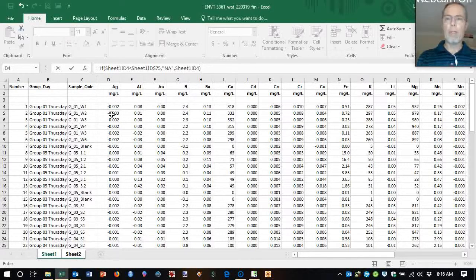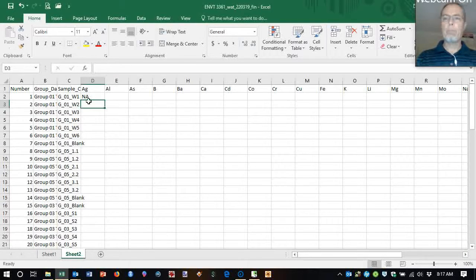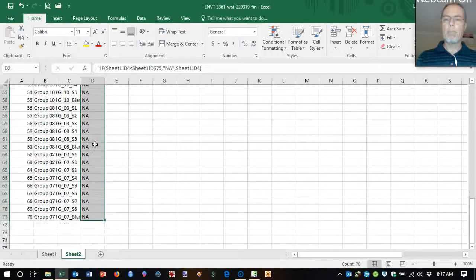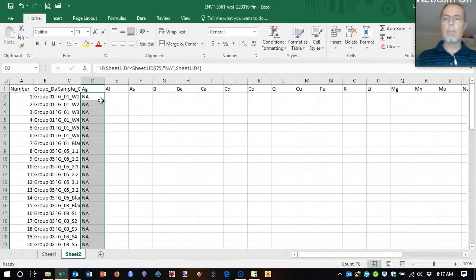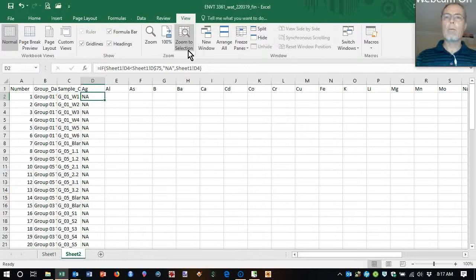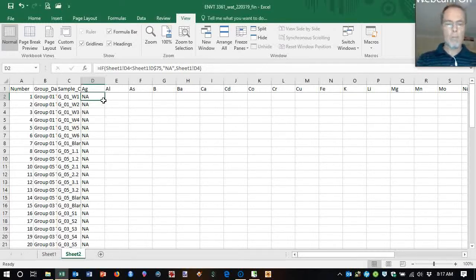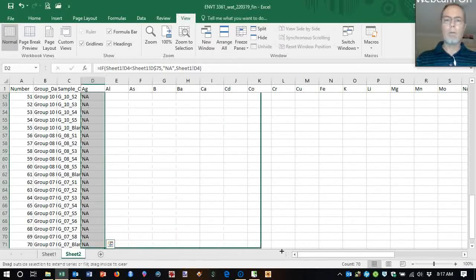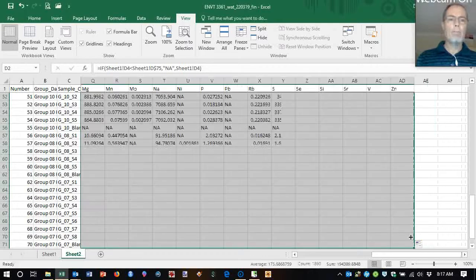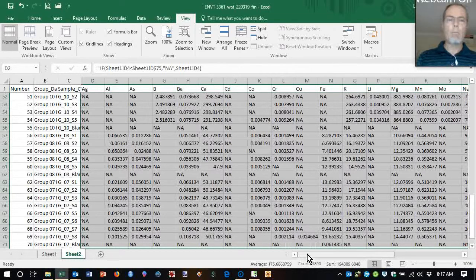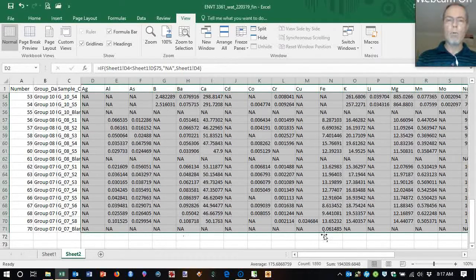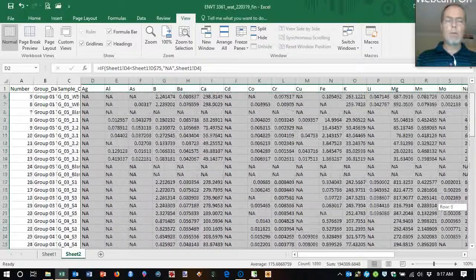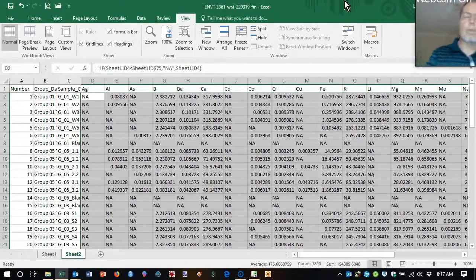So what I'm basically doing is censoring the values and saying that anything below the detection limit is going to be a missing value. I can then copy that down. Looks like everything for silver is going to be missing and that's fine. Just to make life easier for myself I'm going to freeze the top row like that and I'm going to select all those values and I should just now be able to copy that across. You can see that we've got a bunch of missing values in there but not everything. What we should expect to see is that the blanks are all or at least mostly missing values below detection. They're not always but we're going to fix that up anyway.